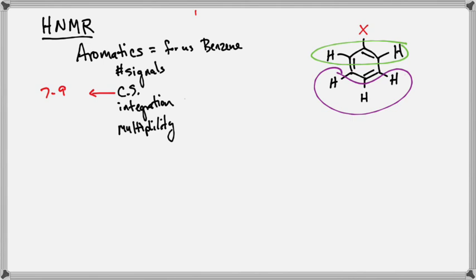Okay, except, is this hydrogen different from this hydrogen? Yeah. Okay, is it a lot different? No, and this could go into potential complexities that we'll touch on here in a second. Because part of this isn't just structure to spectra, but you're looking at spectra and saying, how does that mean structure, right? Okay, so we want to understand both dynamics.